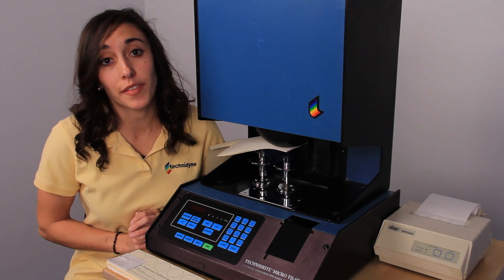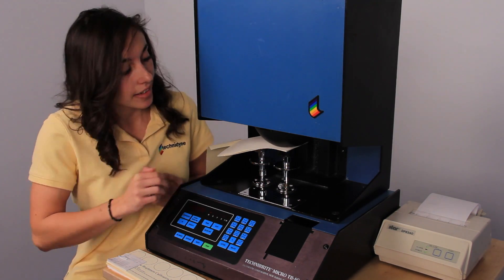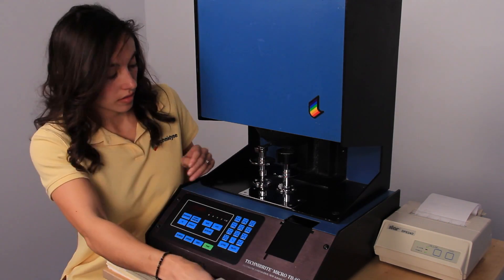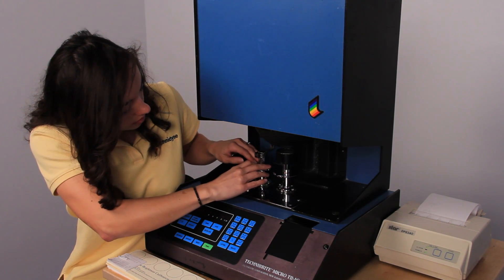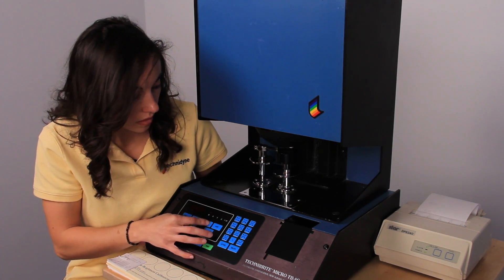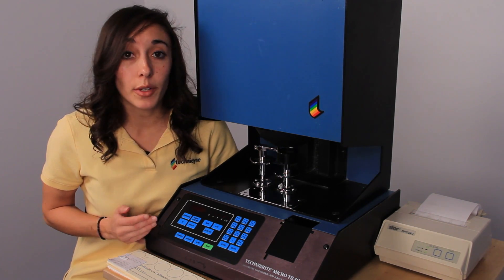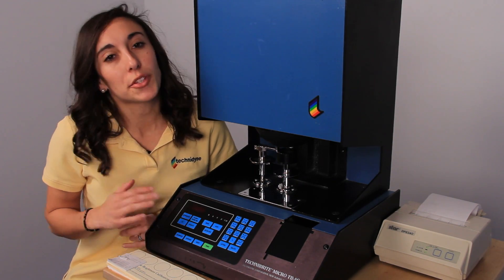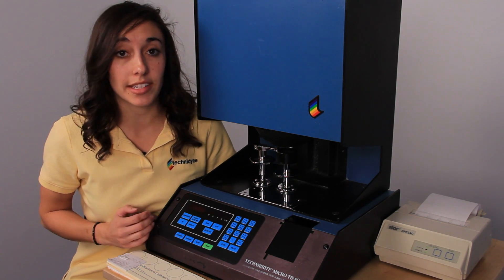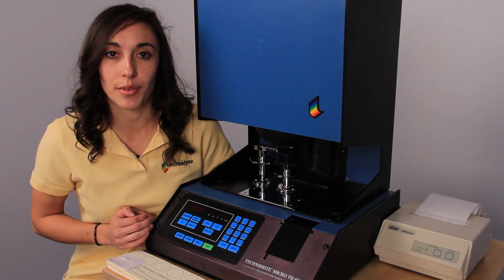Our next step is to evaluate the swing-in standard, which we'll do by loading the standard and pressing scan. This can be used on a regular basis to calibrate your instrument between the primary calibrations. You're going to get a printout of your swing-in standard results, and we suggest that you keep these numbers on hand for future reference.